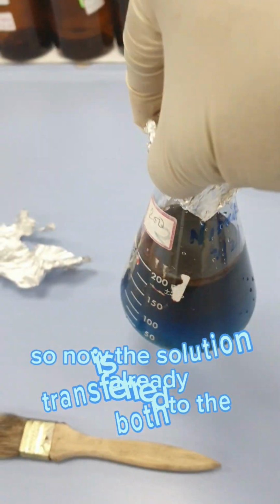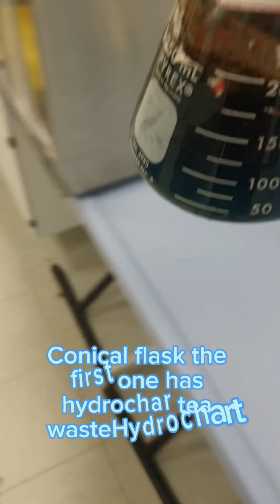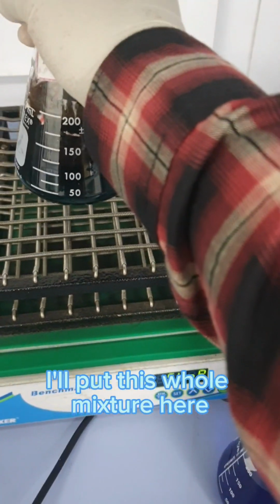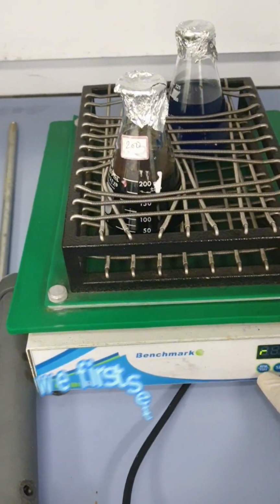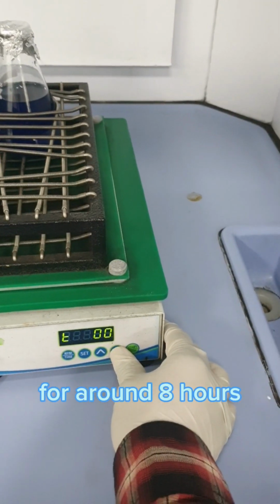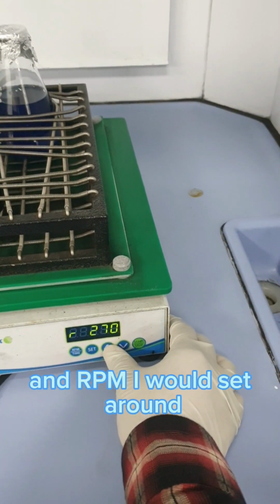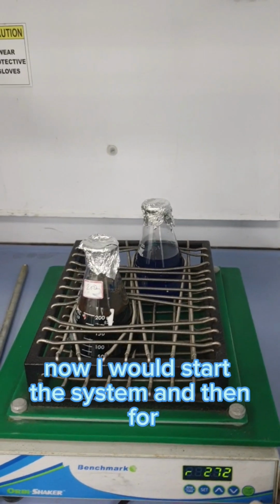So now the solution is already transferred to both the conical flasks. The first one has hydrochar, tea waste hydrochar. We'll put this whole mixture here and start the orbital shaker. We'll first set the time, so I would set the time around 8 hours, and RPM I would set around 272. Save now. Now I would start the system and run for 8 hours.